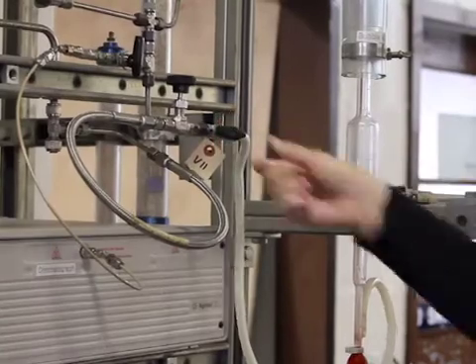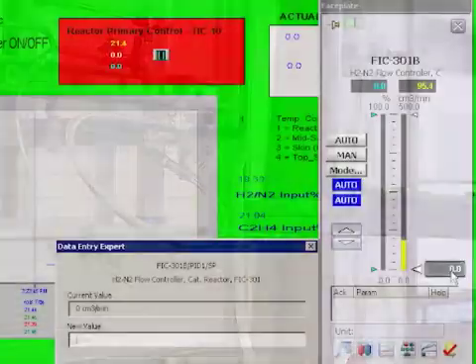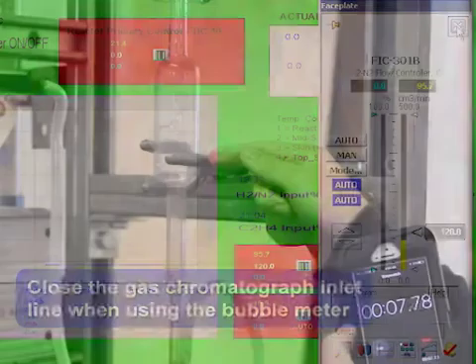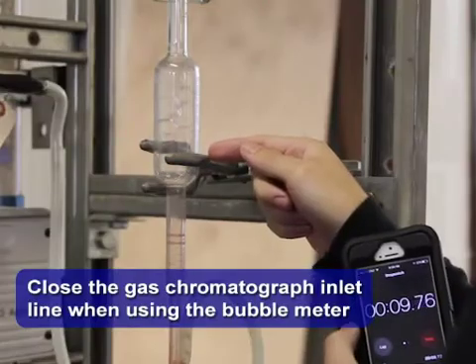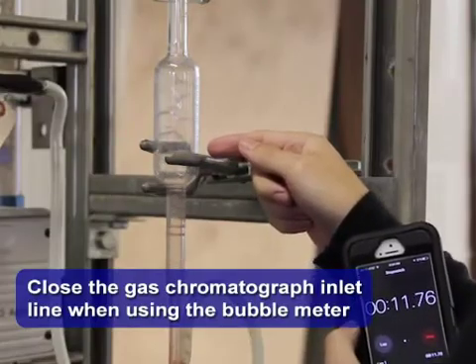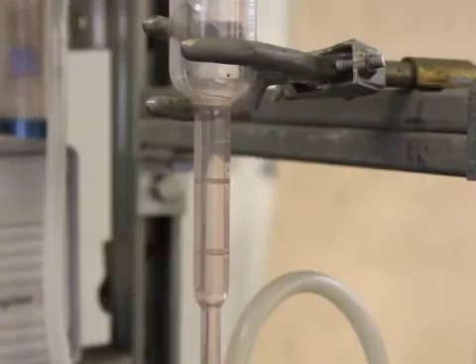Switch the reactant lines to pass through the bubble meter and begin gas flow. Use the bubble meter to set the initial reactant flow rate. Subsequent flow rate adjustments do not need to be measured through the bubble meter.